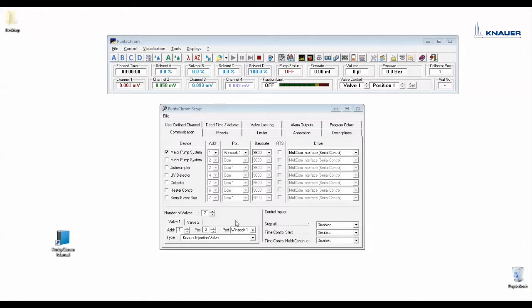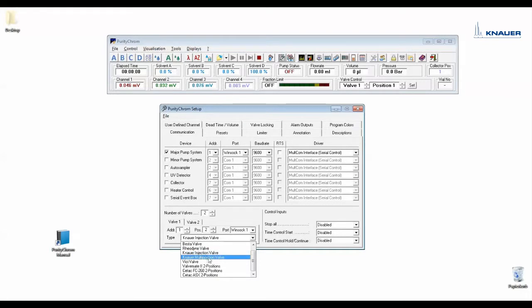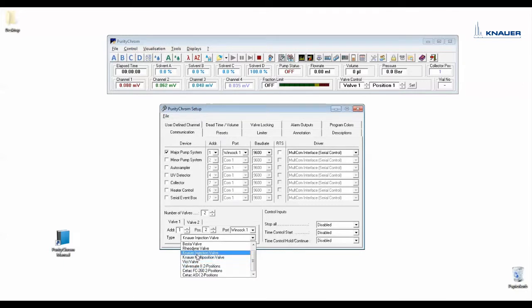Under port you enter the LAN or COM port which you have entered for this valve in the Purity Chrome.ini file. The type you can choose here and it is a Knauer injection valve. If you have a multi-position valve you would use Knauer multi-position valve. For example, if you have a Vigi valve then you would enter here Vigi valve.